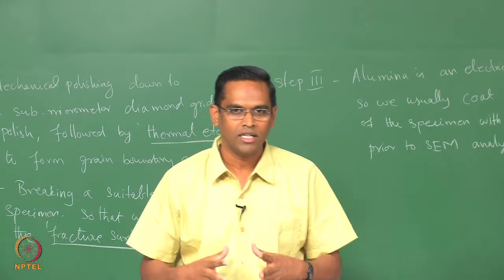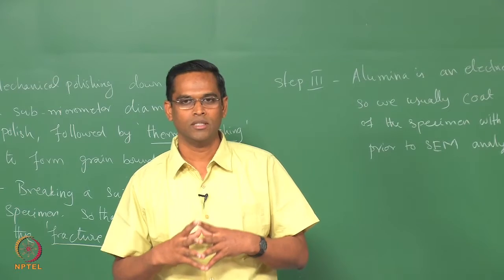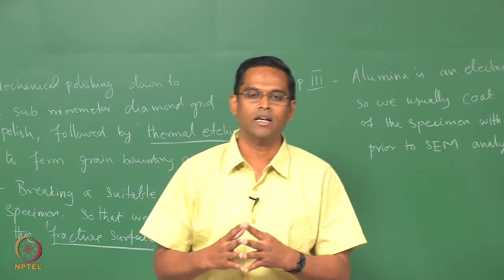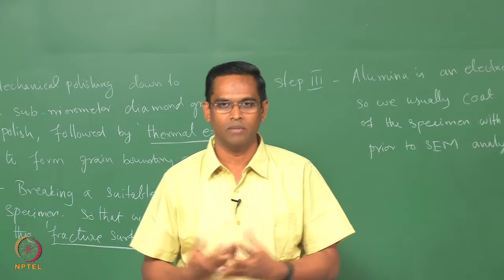So, higher voltage does not improve the image quality, because it also hinders the secondary electrons coming from the surface quite a bit.